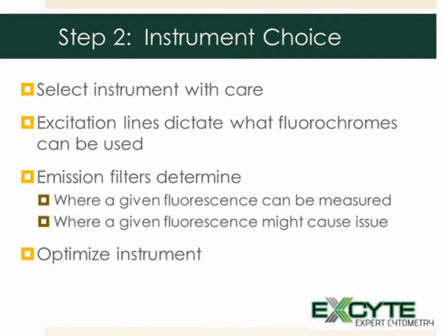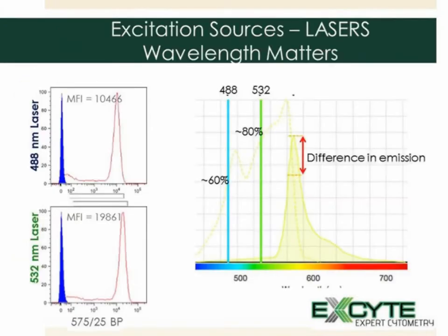Last but not least, you want to know that this instrument has been optimized, so you have an understanding of how the machine behaves as you design your panel, and design the panel to make best use of that instrument, where it's most sensitive and where it's least sensitive.